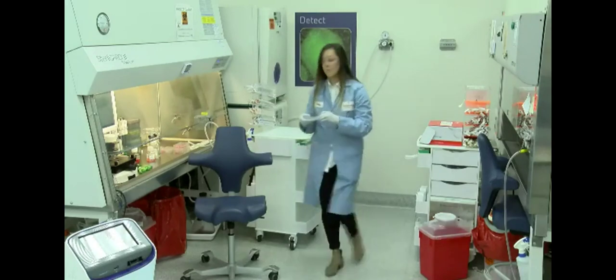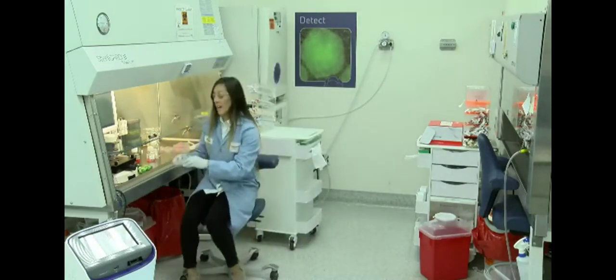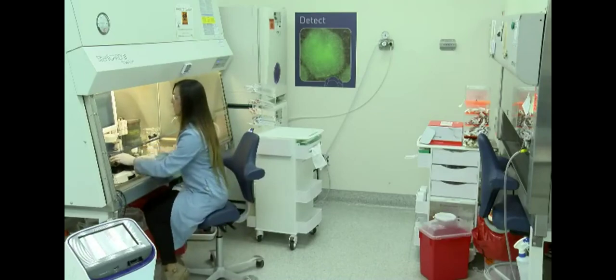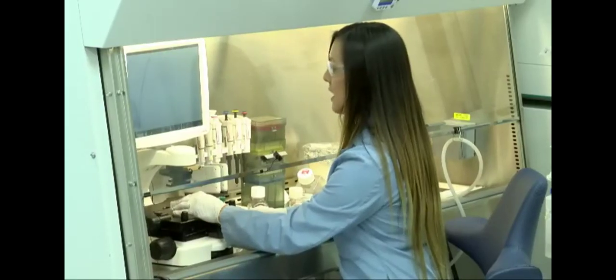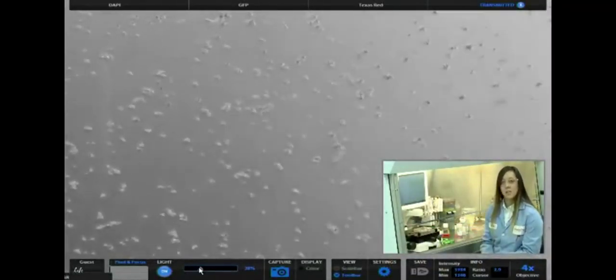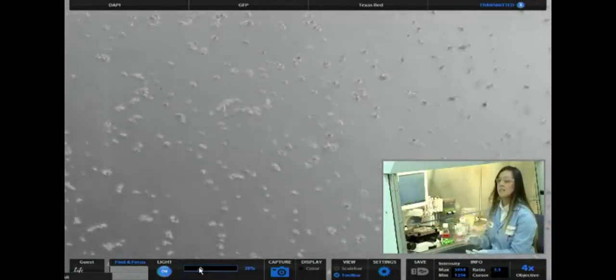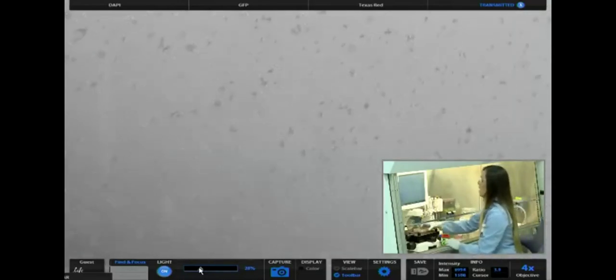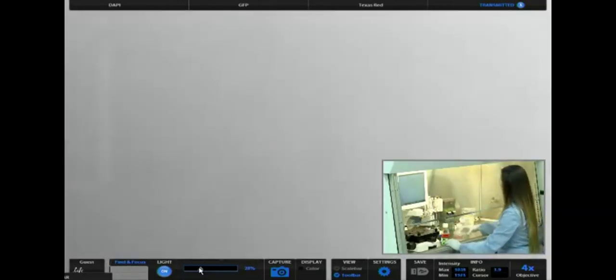So I have a cell well right here that I already previously accutased. And if you guys come over to the EVOS real quick, you can see they're all pretty singularized and they're floating around now. So they're no longer attached to the well. If you still find that your cells are attached because of starting a really dense NSC culture, you can also use a cell scraper to scrape off the rest. But this looks pretty good.